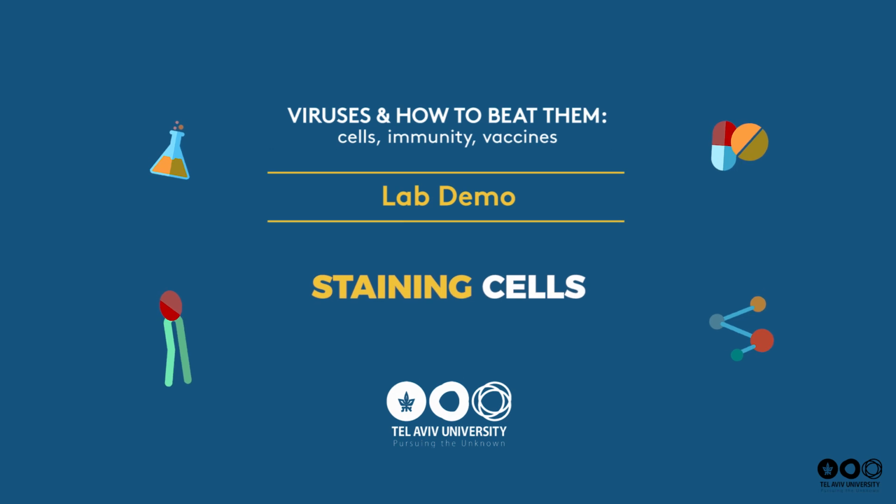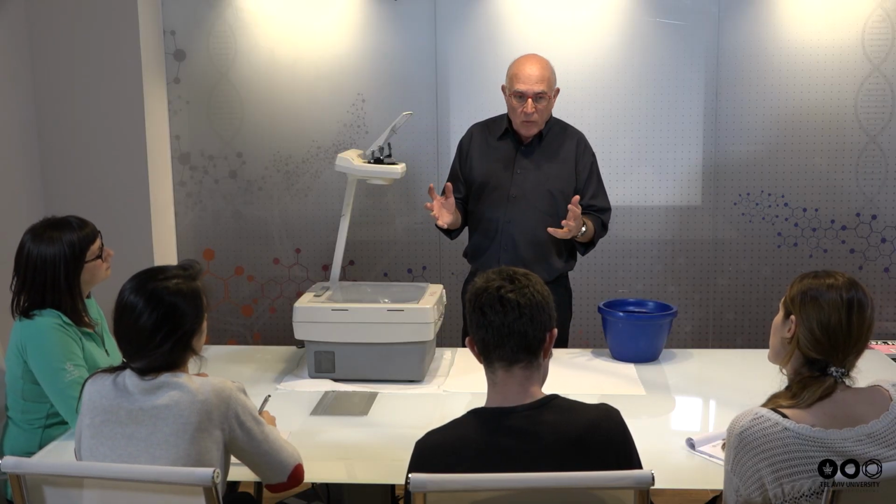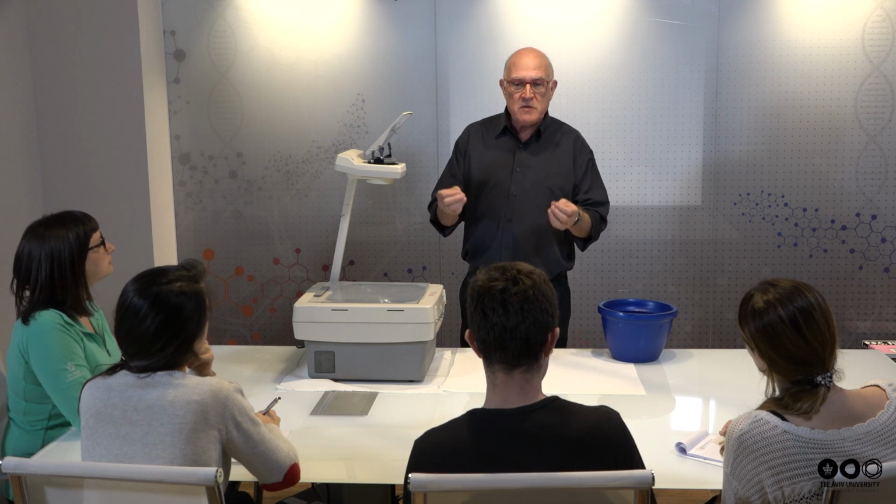Staining cells is based on the ability of certain structures to differentially bind or absorb the stain while the rest of the cell does not. Hi, welcome to the mini class, and today we're going to talk about how we stain cells. When we look at natural cells, actually the contrast is pretty low and we don't really see structures or any detail. So I want to show you how the principle of staining cells actually works.